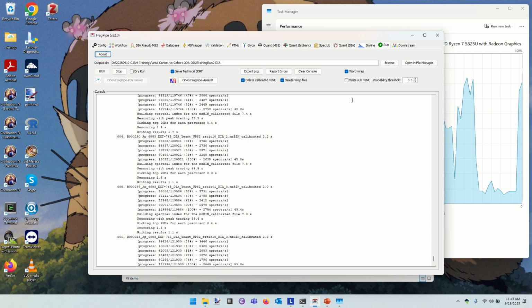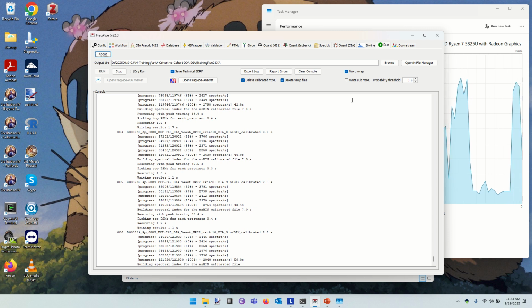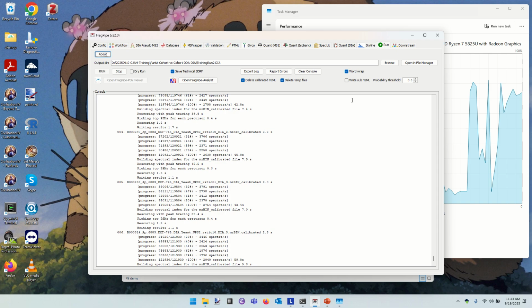So if we were to try to reconstruct how we got to our result in FragPipe the first time, we would say we did identification. We matched peptide sequences to tandem spectra. We did filtering and assembly. We decided which PSMs we trusted, which peptide spectrum matches we trusted, and threw out the rest. And then we inferred a set of proteins to go with it. And then we quantified, basically integrating the speed bump we saw in the MS1 scans.